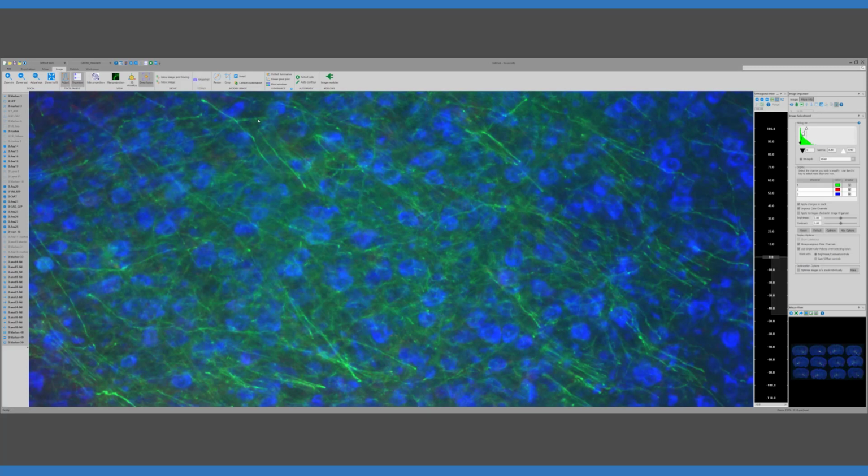What are you using to do that? Can you talk a little bit about the rig and tech you're using to do that scanning? So we use a Zeiss wide field fluorescent microscope, and we use another MBF software called NeuroLucida, which we image with. And that imaging enables us to image. Let me zoom out a little bit.